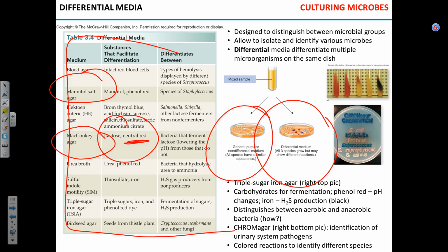It's more likely to be a host for bacteria. Okay, so lactose increases the growth capacities of bacteria. But then you may say, well, if they overgrow, they may cause disease. So it's from human intestines. And the ones that can digest lactose, can use it in fermentation, are usually non-pathogenic. Why?